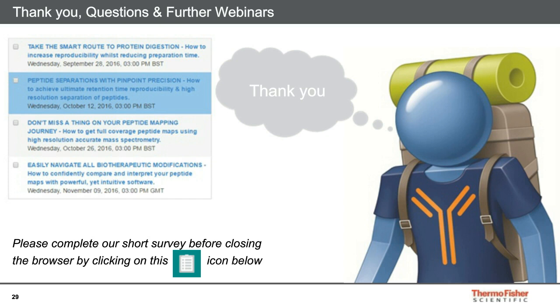Thank you, Martin. The next question is, what is Smart Inject and what is the main benefit? Okay, so Smart Inject is the name of the feature that allows us to compress the sample that is withdrawn from the vial and bring it to the same pressure as the column pressure.